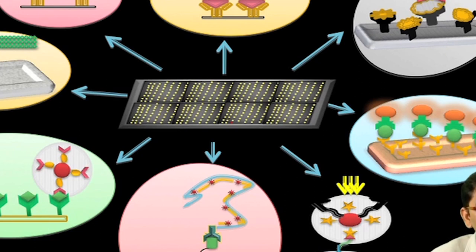These various novel detection techniques which we have discussed today have facilitated sensitive, specific, high throughput as well as rapid analysis for many proteomics based applications. The label based detection systems have taken rapid strides to satisfy the demands of proteomic applications with significant improvement in sensitivity, multiplexing capability and reproducibility.